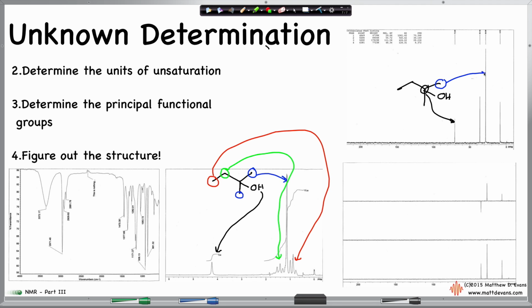Even though we don't integrate, you can probably assume that the bigger peak is 2 carbons versus 1. That brings us to the next carbon, which is this one. According to our results, that one is going to be this one right here. And then finally, we've got this one right here.